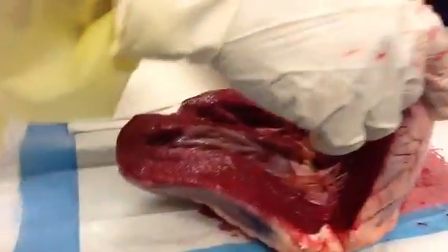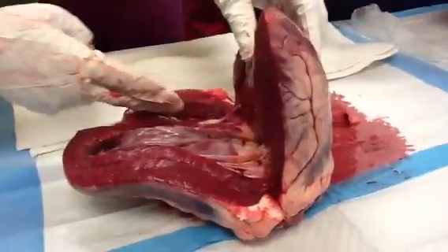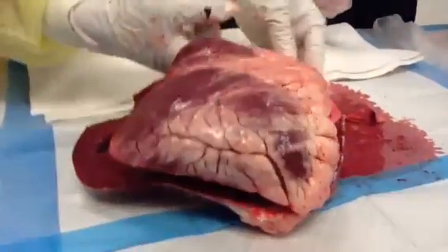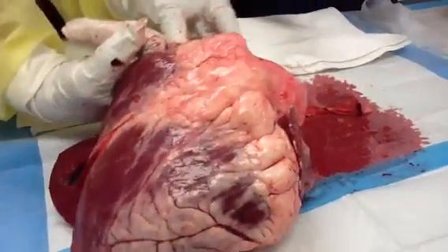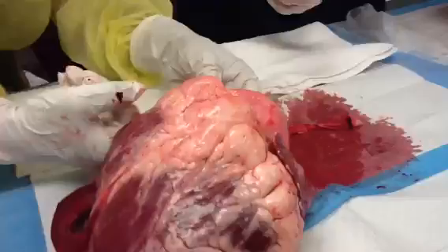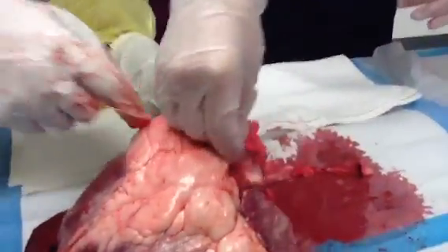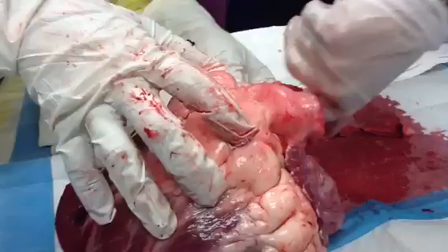If any of y'all want to touch it, there's masks, there's gowns, there's gloves. This has to be the left ventricle. This is the left atrium right here. Did you say you were hungry? This would be the right atrium, right?